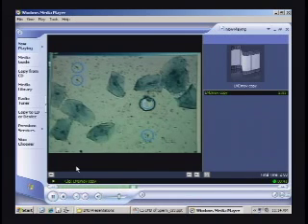Again, it'll actually be faster in the lab. I was running in about 20 minutes I could cut 100 sperm cells. And we'll see how fast you guys can cut. The laser now is more powerful, and so you can cut faster, which is great.